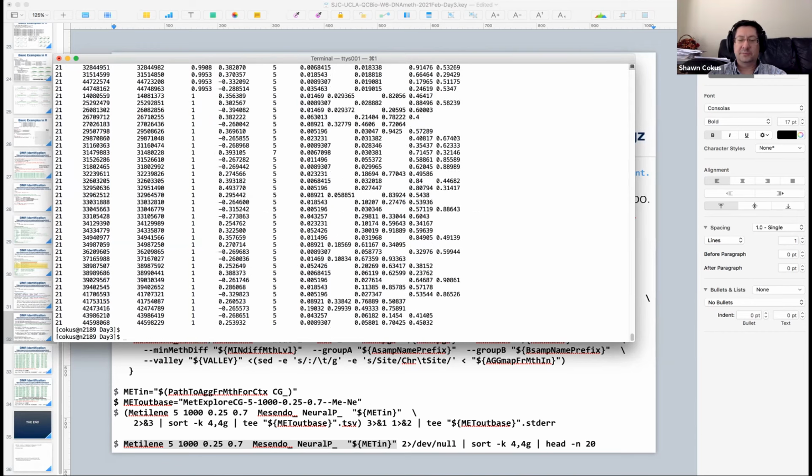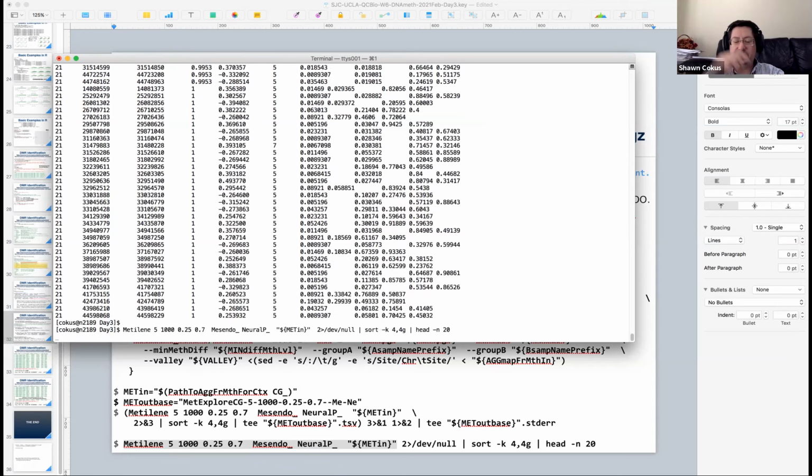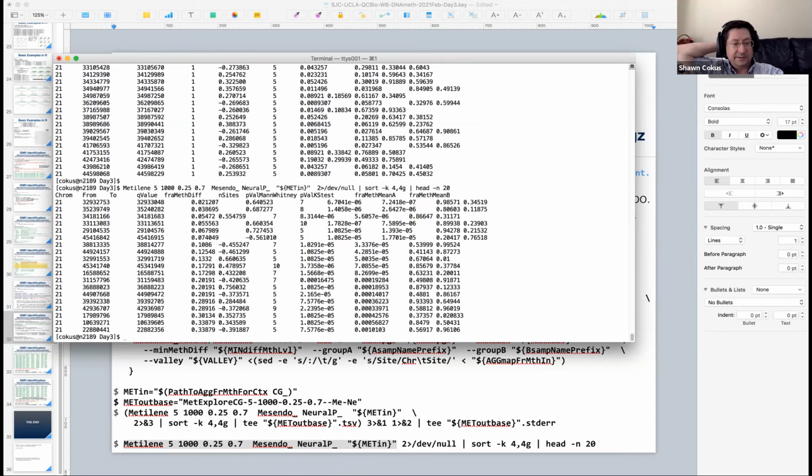And we're just doing chromosome 21 here, right? We've come down to a really small fraction of the genome. To get anything out at all, we should be happy, I guess. And then let's just, for experimentation, cut it down to the first 20 lines. So that's basically the top 20 by FDR-corrected p-value. And that gives us something we can look at a screen full at a time and maybe start kicking over to IGV and start checking these guys out.